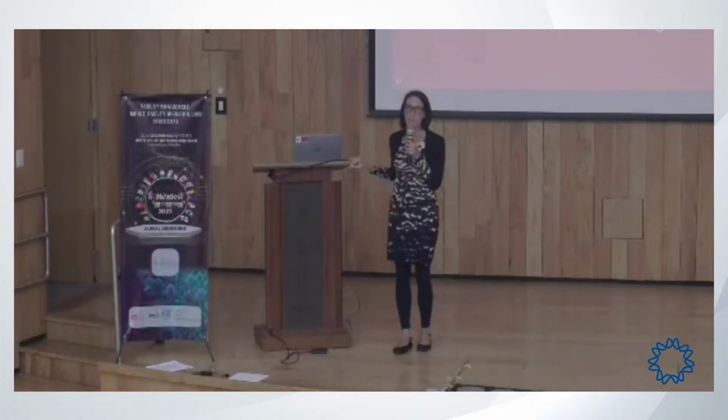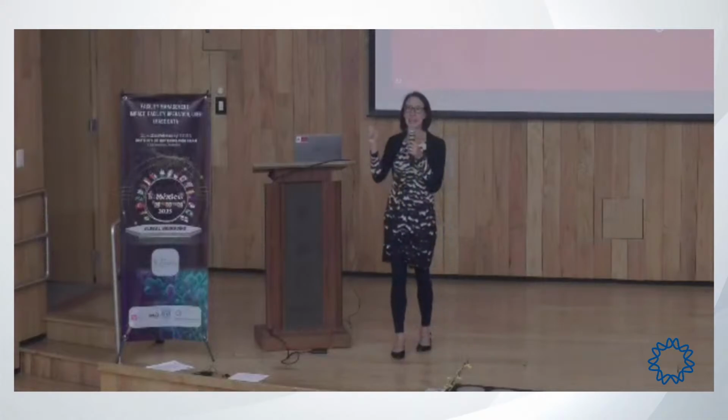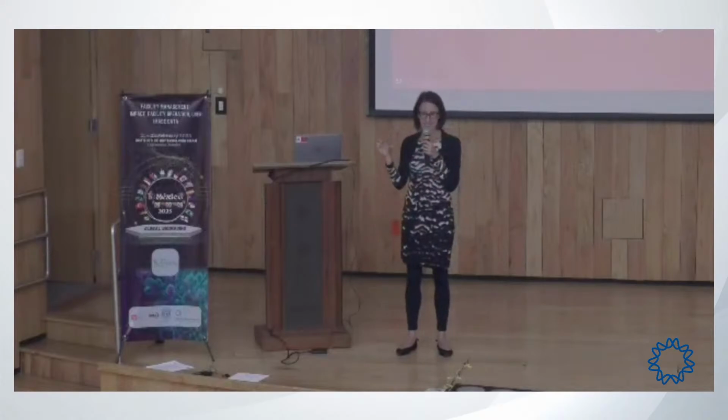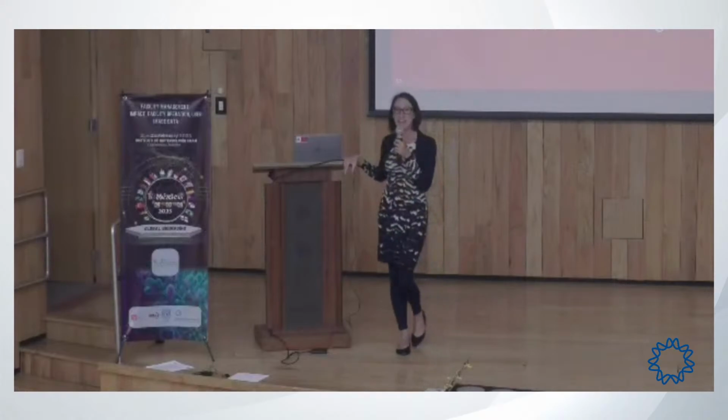Second question: all proteins, what about nucleic acids? Can you do the same type of approach with nucleic acids? Yes. We are working a lot right now with DNA and RNA, not only DNA or RNA associated with proteins, but by themselves. And that's very challenging because, as you know, they can be quite flexible and elongated. So it's always more difficult to do the 2D alignments with those elongated samples, but we are doing that right now. So yes, it's possible.